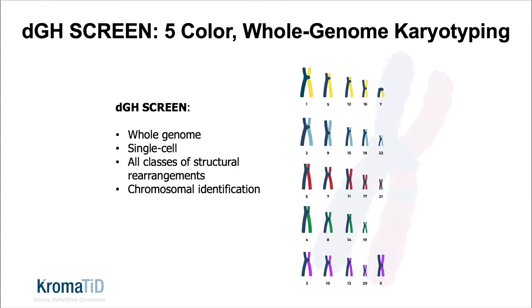What our cartoon illustrates with these unbroken signals on a single chromatid is the genome of a single normal cell without any structural variation. Chromosomes can be identified and counted by color, shape, and centromere position. Measuring structural variation in this system is as simple as tracking changes to the signal pattern. Signals changing from one chromosome to another are translocations and insertions. Signals moving from the painted side of the metaphase chromosome to the unpainted side of the metaphase chromosome are inversions.